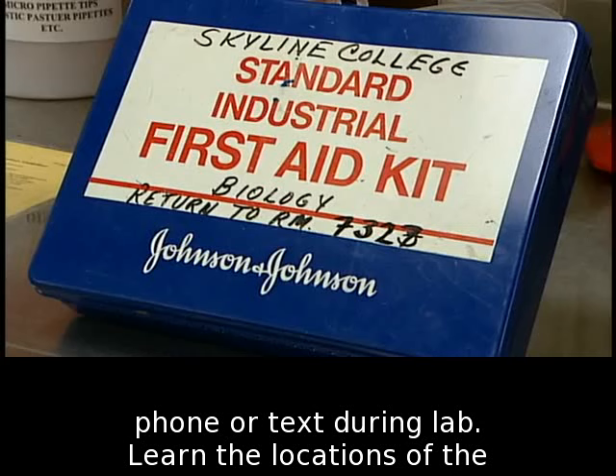Learn the locations of the first aid kit, eyewash station, and fire extinguisher.